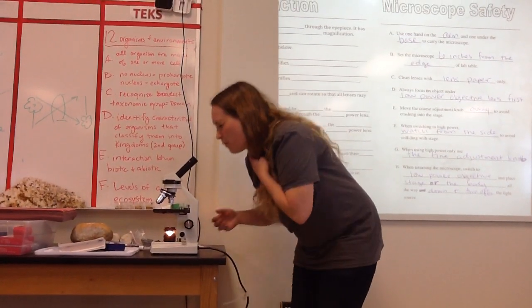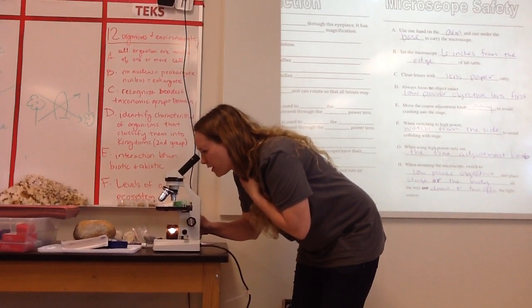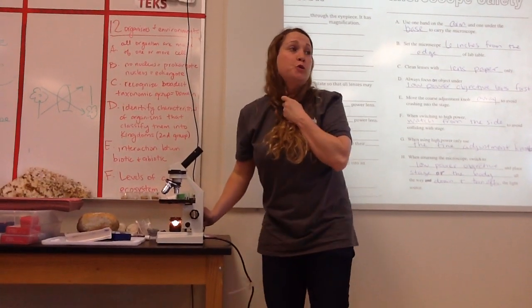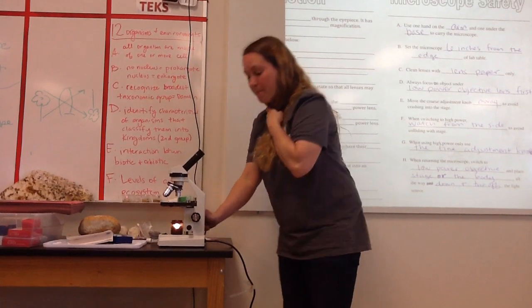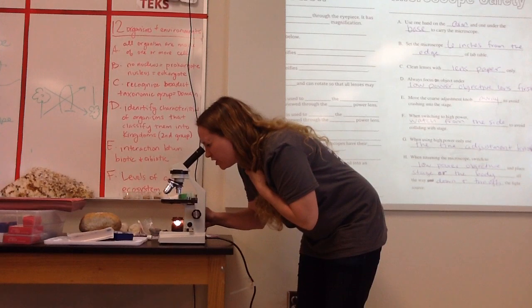All right. So my image is in the middle. I take my big knob, and I start to back up. I'm backing up, I'm backing up. Can you see the stage slowly moving down? You do it super slow, like a snail. Okay, so as it backs up, the image goes from a little bit blurry to clearer and clearer.